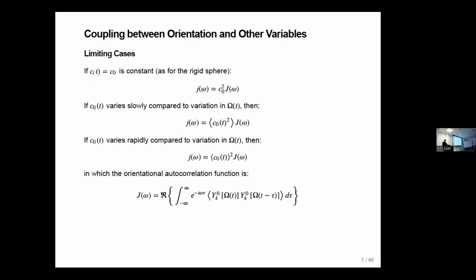If you have analyzed nitrogen 15 relaxation in solution in proteins, measuring R1, R2, NOE, which is a very common thing to do these days, you would see that the NH bond length that's used is either 1.02 angstrom or 1.04 angstrom. But if you go and look in, say, a molecular dynamics force field, you're more likely to see a bond length of 1.01 angstrom. And the difference has to do with the averaging.